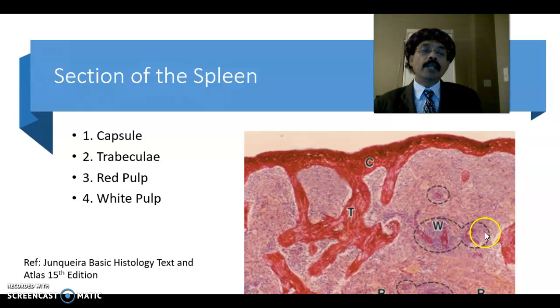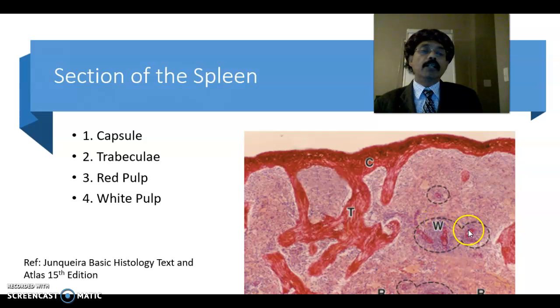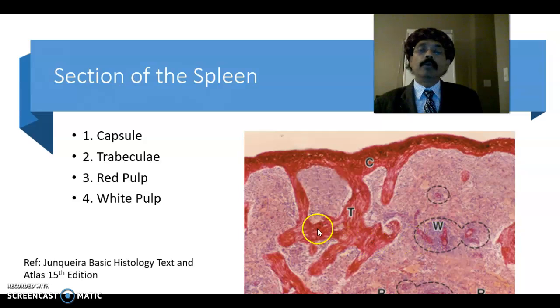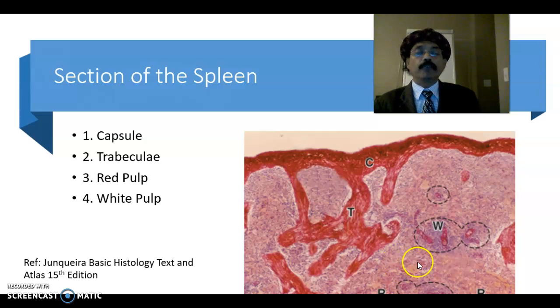The white pulp is the lymphatic nodule area, and the rest part is the red pulp. The red pulp contains the sinusoids and the cords — lymphatic cords, also called Billroth cords. The lymphatic nodule and artery form the white pulp, and the red pulp is composed of the lymphatic cords and sinusoids.